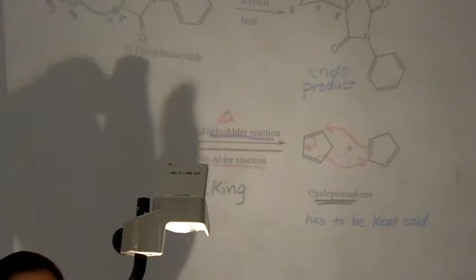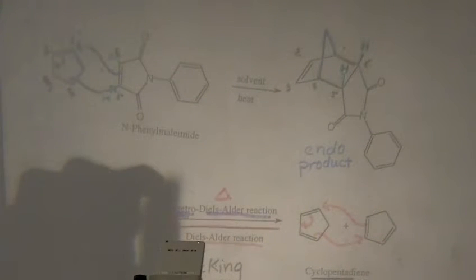Then you're going to want to do, and in a minute this will make more sense, you're going to spot this for TLC, then you're going to reflux it for 10 minutes, okay? Then you're going to spot it for TLC again, and then you'll go through the workup, and then you'll be analyzing your final product as well, okay? So in a minute, I'll explain what all that means, but just keep in mind that those are steps that you need to take along the way. Besides just running the reaction, you need to worry about making sure you're spotting it for the TLC analysis, okay?